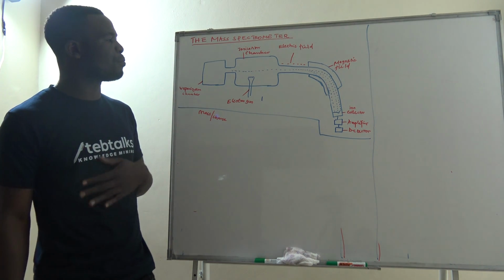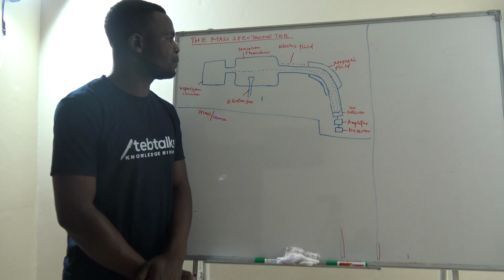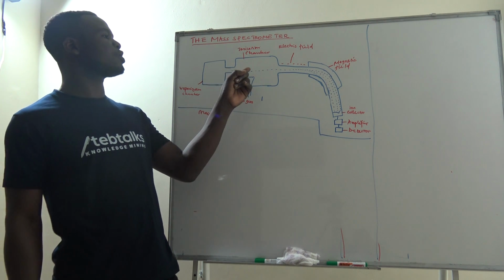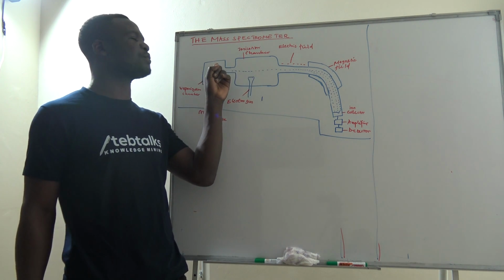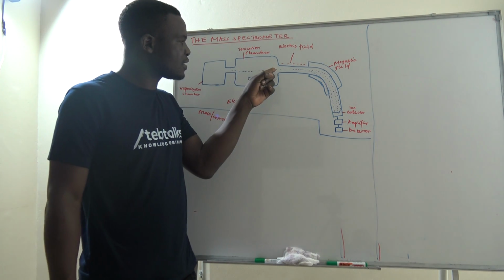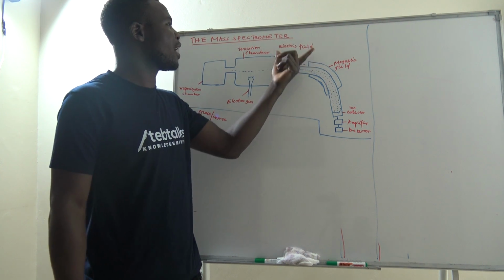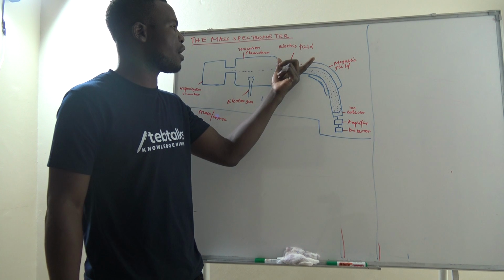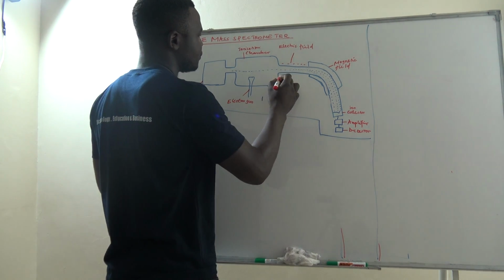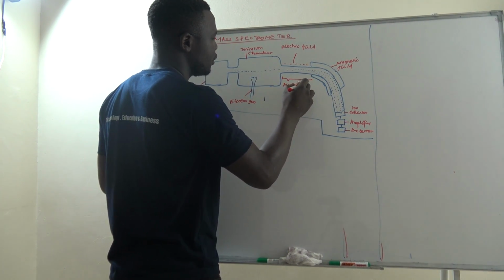Now, to the produced molecular ions, we apply an electric field, a negative potential, such that the positive molecular ions, which we know will always tend to move to a negative field, are accelerated in a straight line. So this is the acceleration chamber here. If we name it in terms of chambers, this one will be our acceleration chamber.